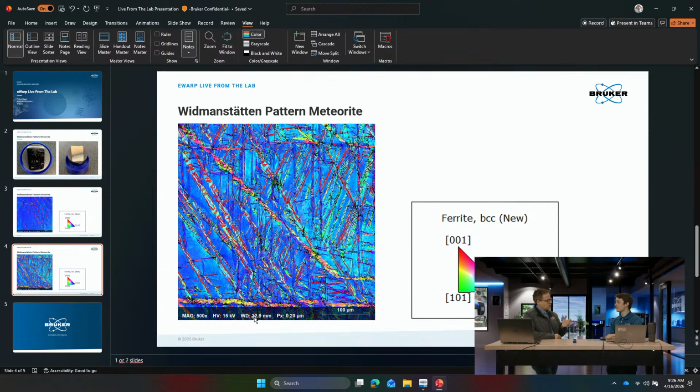This speed, I think that's really the story to me: EBSD becomes very relevant now. Before it was kind of niche. It was like, oh yeah, we could do that, it'll take a little while. But now it's so fast, and you get the feedback, like you said. If I prep the sample, I can see in the quality map that I need to go back, redo some polishing, and do the map again. If you had to do an overnight scan, that becomes kind of a nightmare.